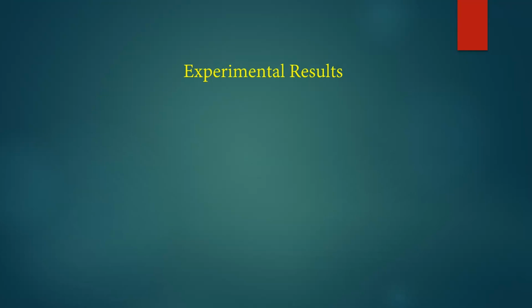I know that was a pretty involved pre-lab introduction to our experiment, and it is a rather complicated topic. So now it's time to actually carry out the experiment. I will be conducting each of the reactions in part A and B, and I will attach videos of each of those, and then I want you to record your observations in the tables, and then use that information to answer the questions at the end of the lab.